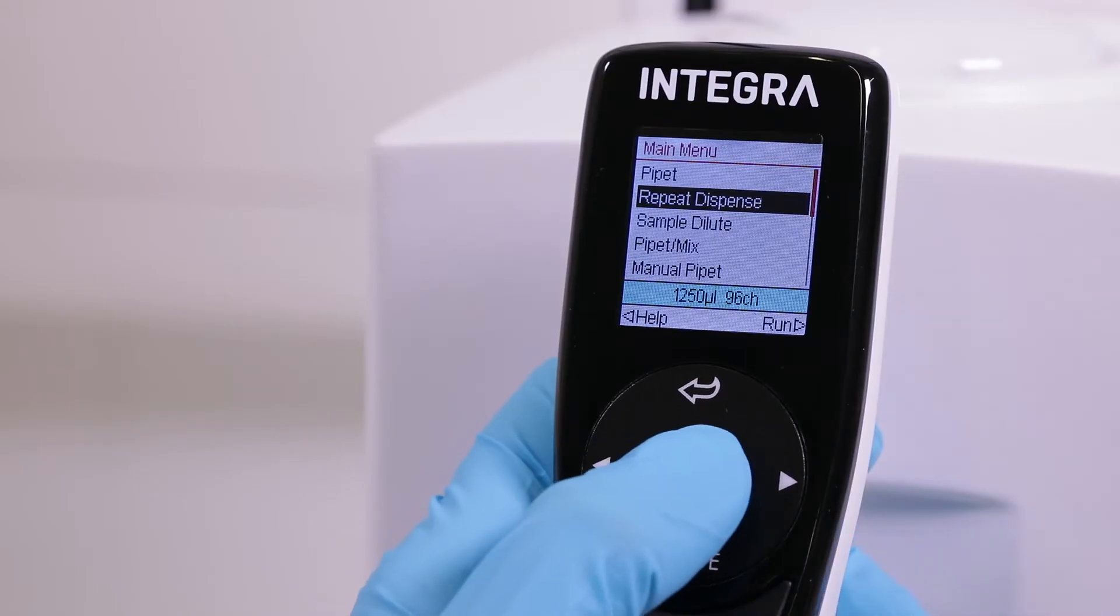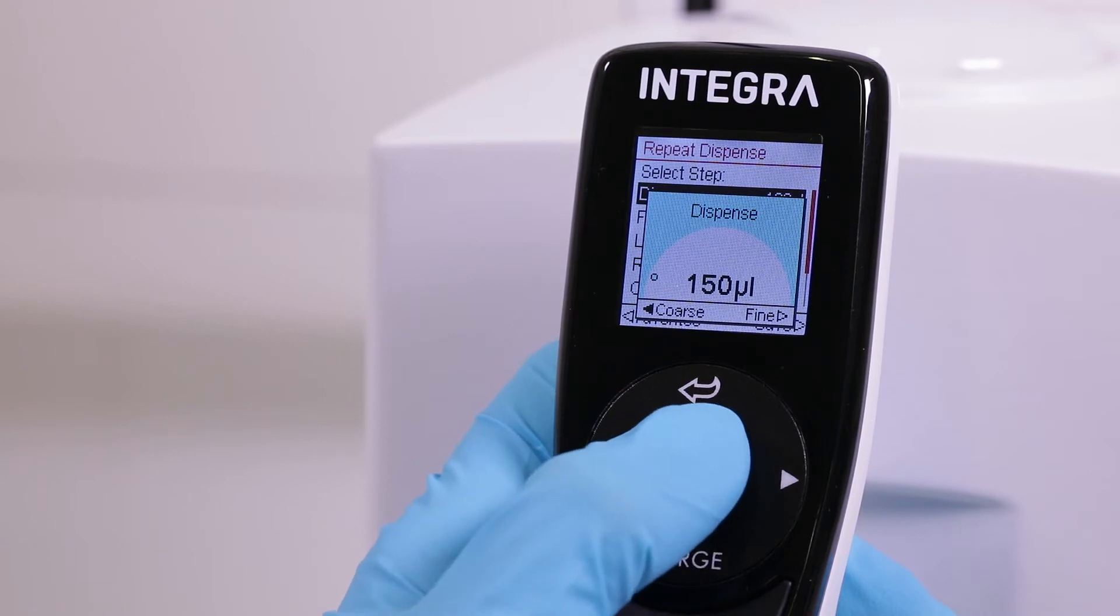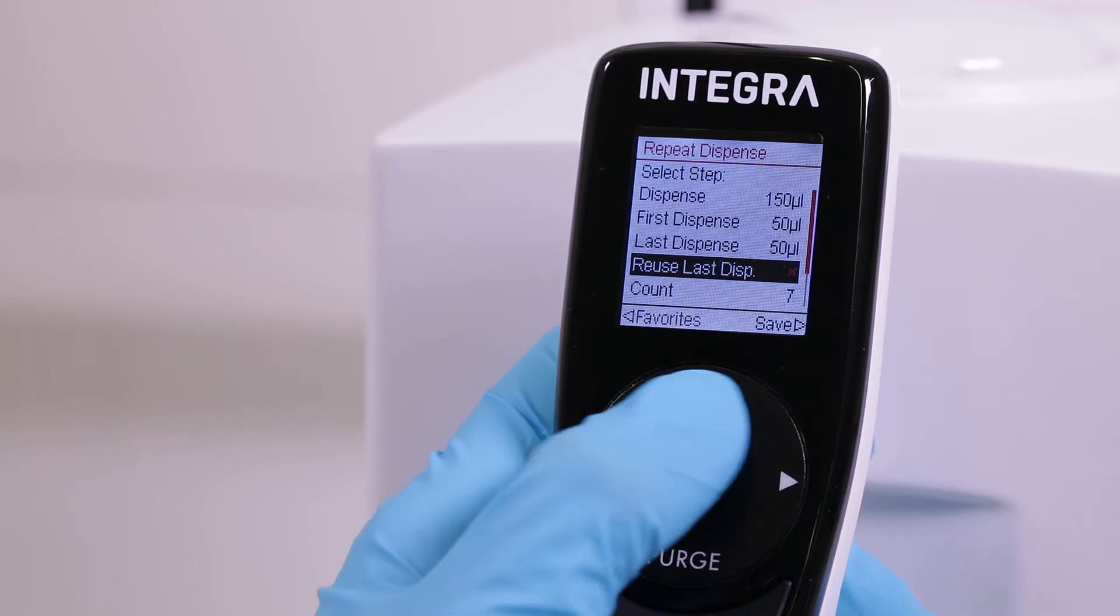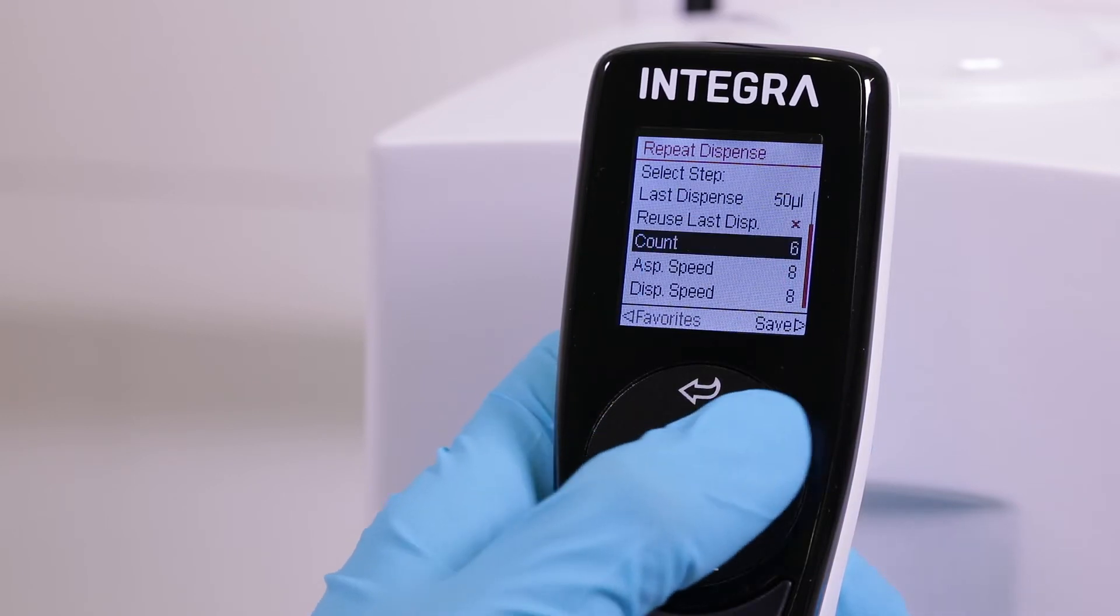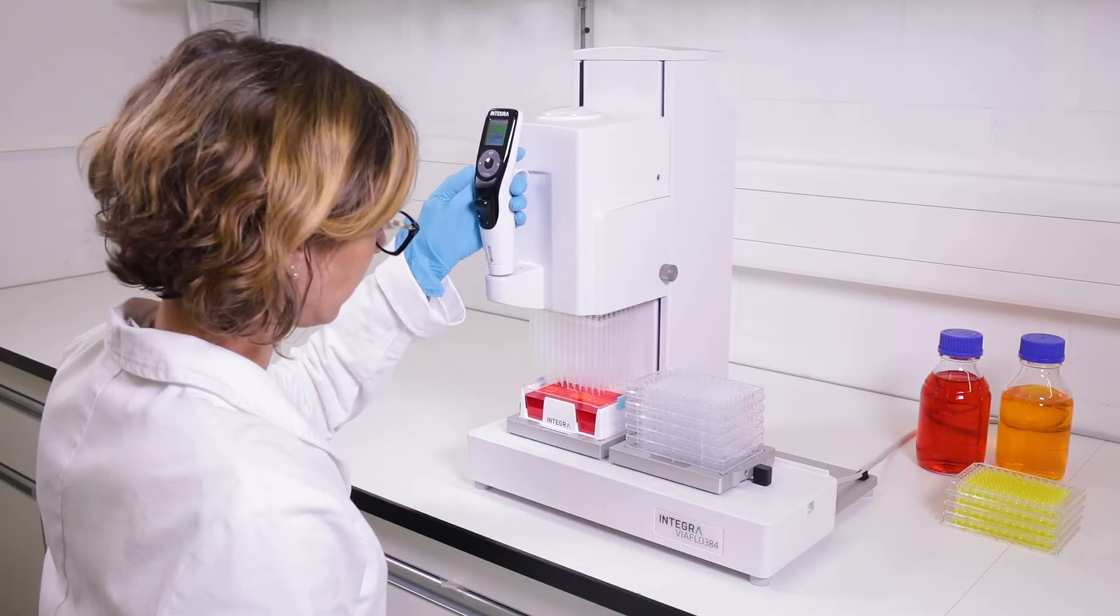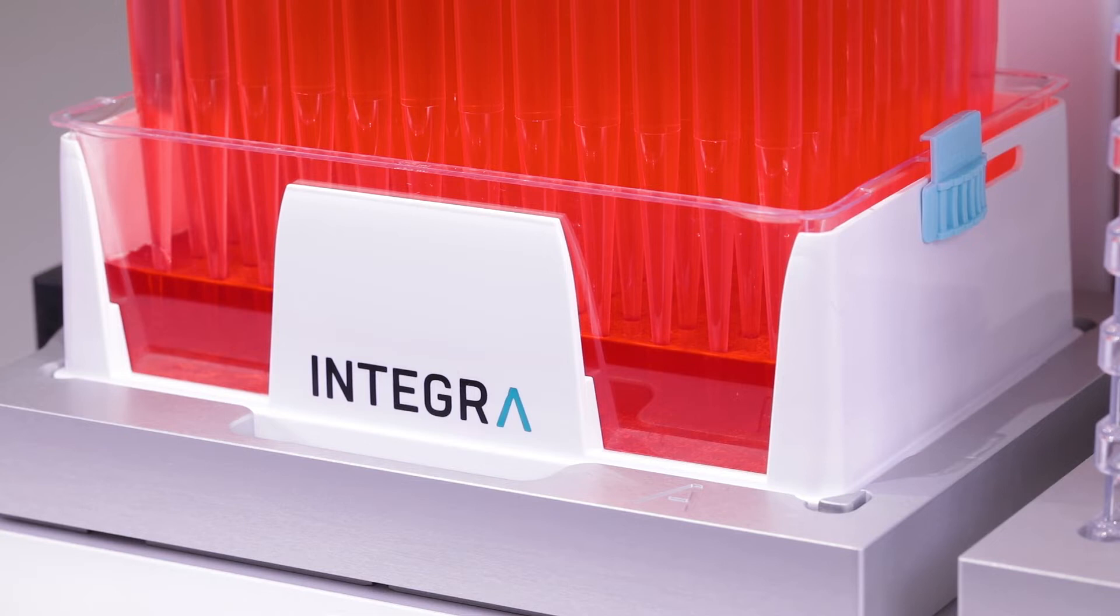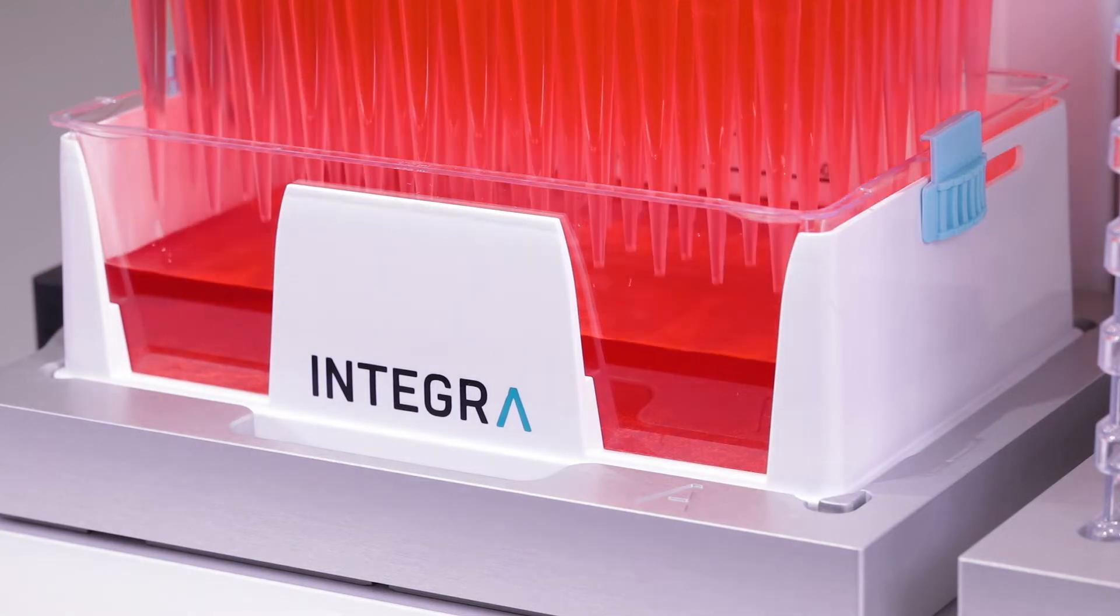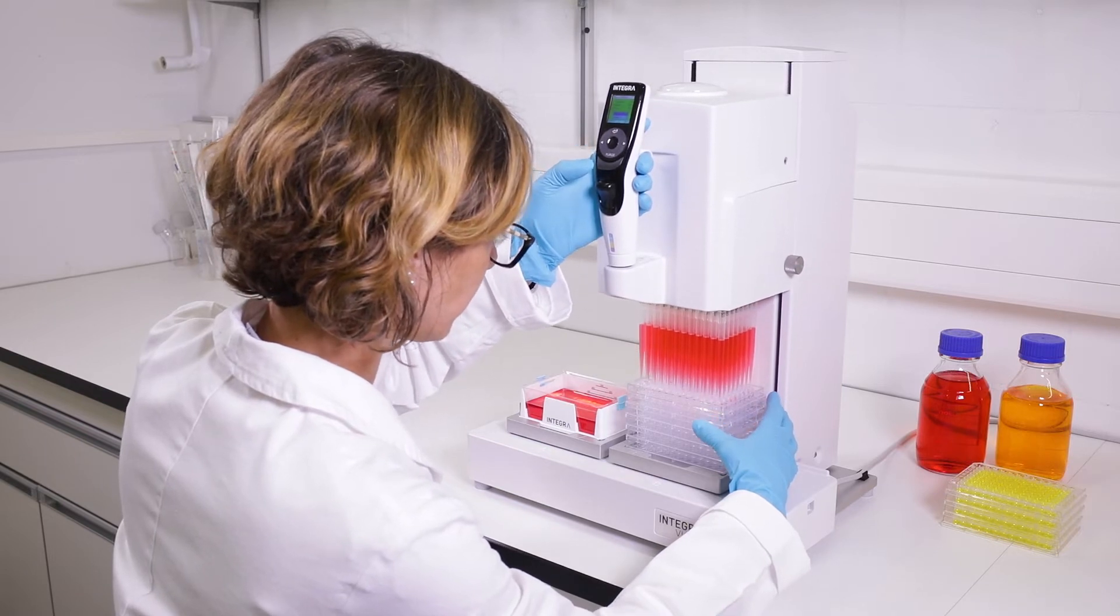Repeat dispense mode allows precise dispensing of multiple aliquots from a single aspiration, enabling extremely efficient and fast filling of multiple microplates. Filling 6 96-well plates takes only 30 seconds. In comparison, filling the same 6 plates with an 8-channel pipette takes almost 2 minutes.